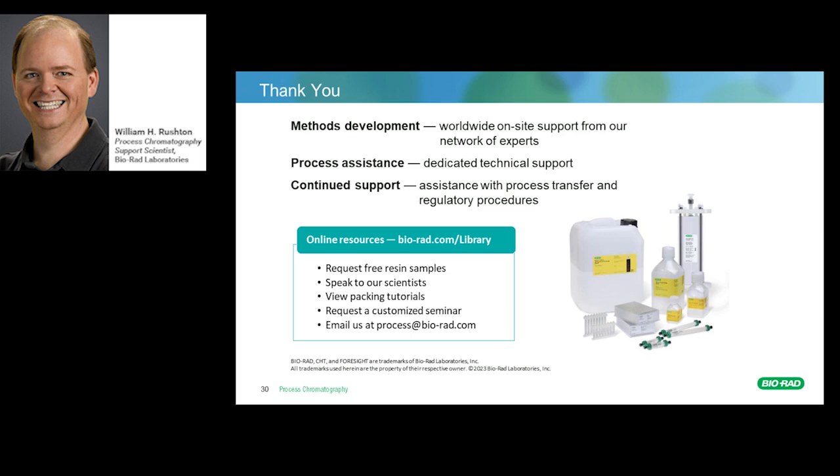That's a great question, Alex. Yes, we do have viral clearance data for CHT. There are a number of papers online, including one by Bio-Rad that was evaluating PEG enhancement of viral clearance on CHT. In those cases, we've seen very good, robust viral clearance, 3 to 4 logs clearance, which is considered significant removal of viruses.